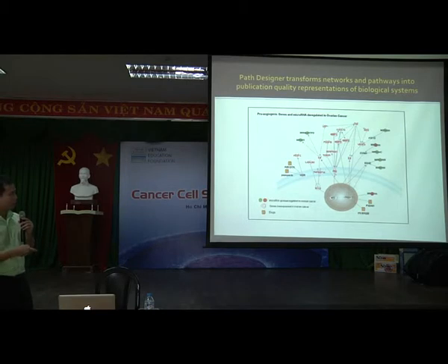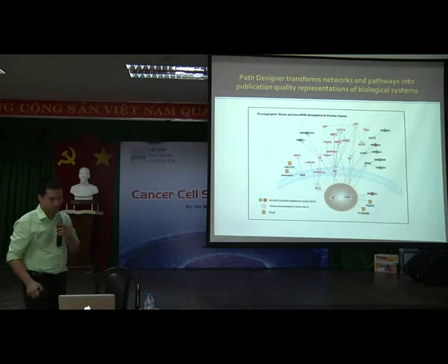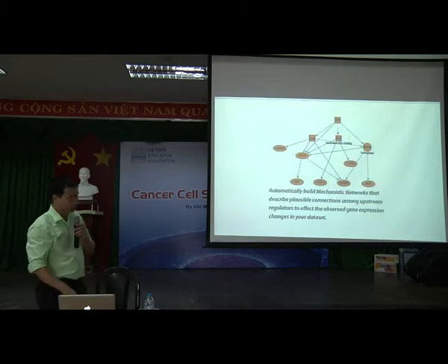So you can see this is a very informative map, showing you how the genes interact, for example, c-MYC and HDAC, and how the microRNA can target them, and also the drug as well. For example, here, this is the drug. They can target the oncogenes, or for example, here, HDAC1, etc. And the red and green color will be used for microRNA up or down regulated in that gene, that map.